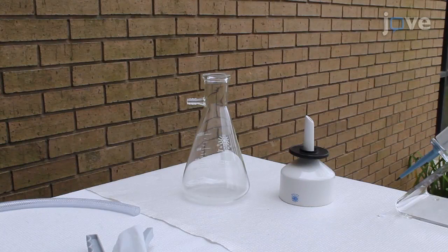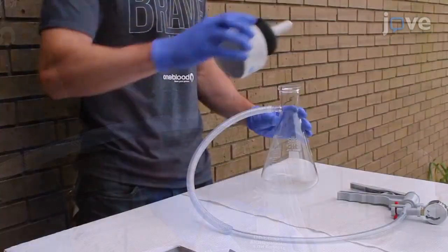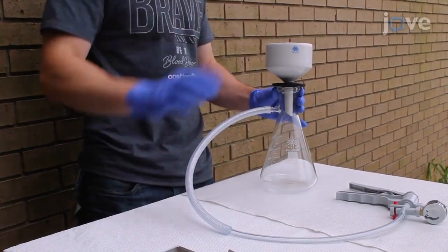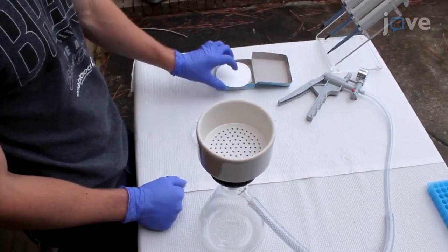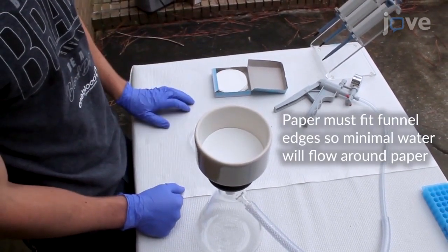To set up a pump and filter for on-site Phytophthora capsaici detection in irrigation water, attach a filtering flask to a tube connected to a hand pump and fit a Büchner funnel into the rubber stopper in the mouth of the filtering flask. Then fit an appropriately sized piece of filter paper with a 15 micron retention size into the funnel.